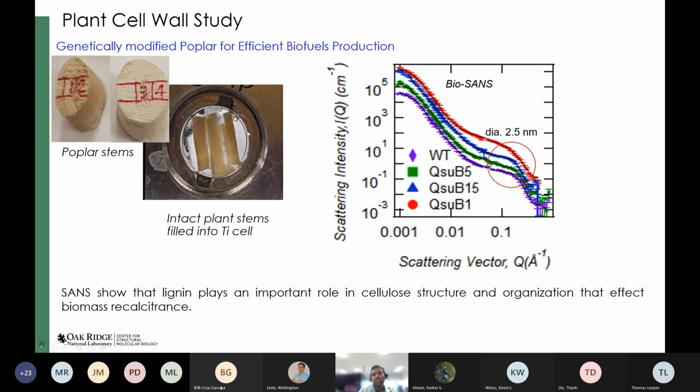And the second challenge is filling the solvent. We are trapping air bubbles.